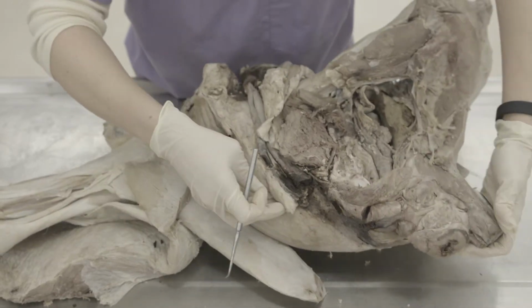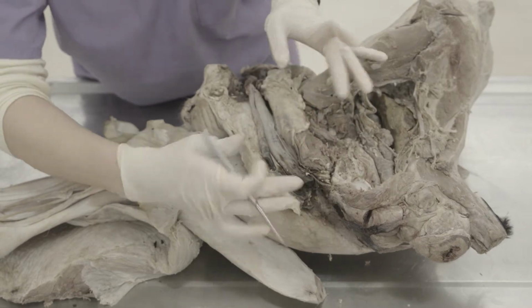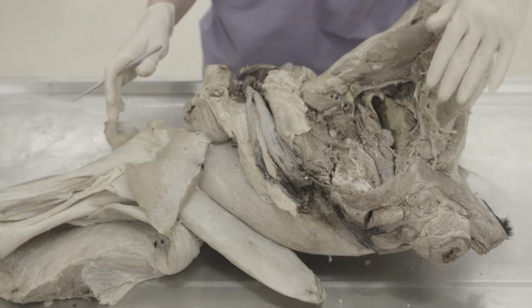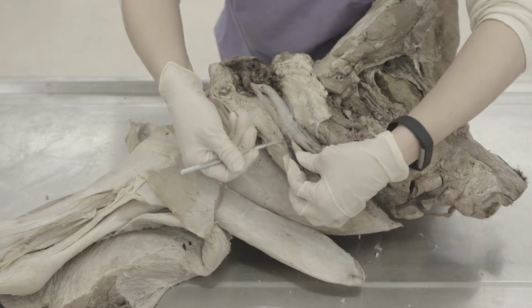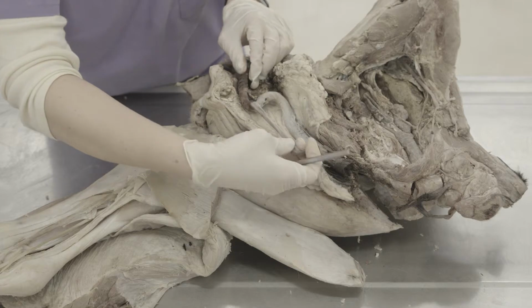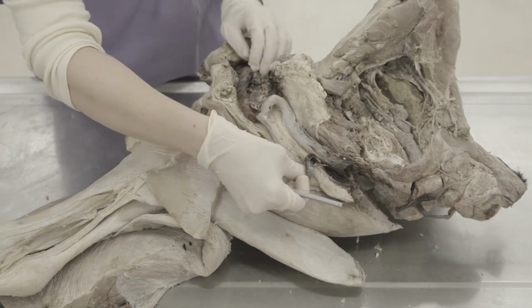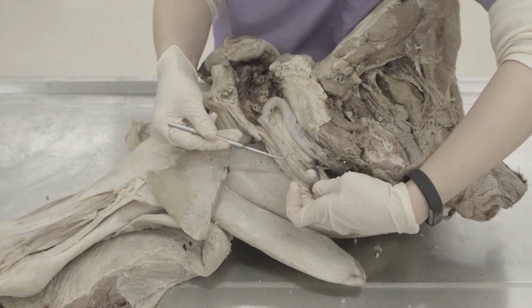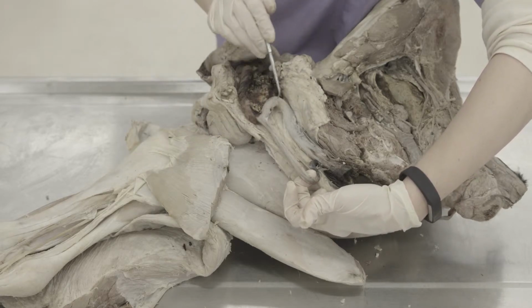Okay, we'll move on to a little bit about the body of the penis here, which is cut, so it's hard to show you, but I do want to try and show you the sigmoid flexure because that's unique to the bovine. And so here, I have my retractor penis muscle that I've dissected out. And if I pull on that, you can actually see it kind of take the shape of the sigmoid flexure again. That shape was taken out when they did the surgery and they repositioned the penis. So we want to just kind of pull on this to see that shape again. And so this is the sigmoid flexure in the bovine penis.